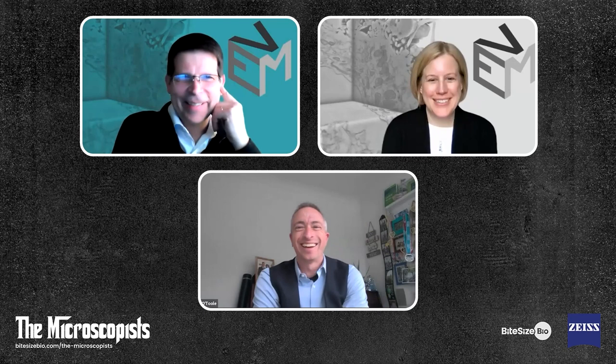Professional mode. So, Kirk, Lucy, is there anything else you'd like to add before we finish? I should give you one last word. Is there anything I've missed that you'd like to say? Two things. I actually want to double click. The reality is that it really depends on the biological question and which tool is appropriate. And to someone just walking into this tomorrow, it may not be obvious. So definitely reach out. It could be myself or Lucy or even the Volume EM community. You can send off a little note and you'll get lots of feedback from people who care.